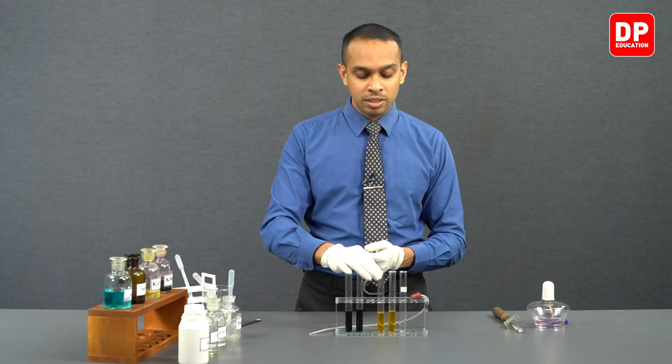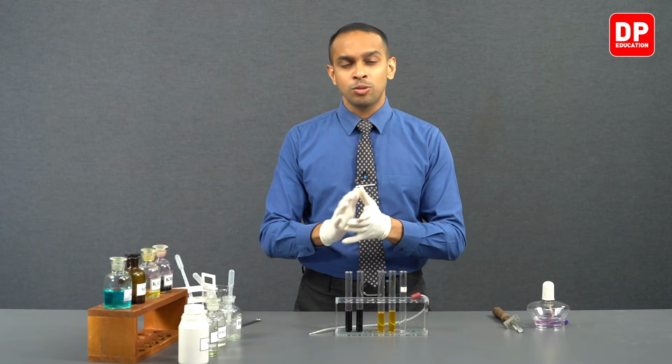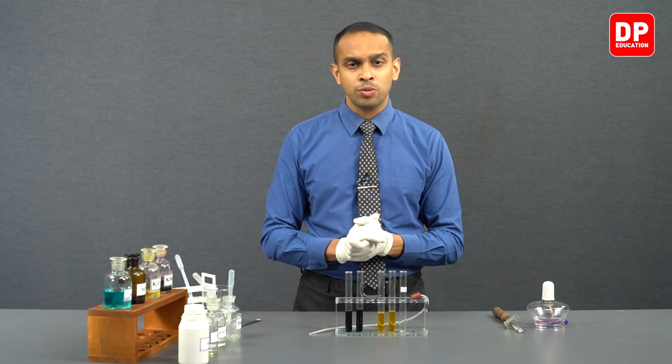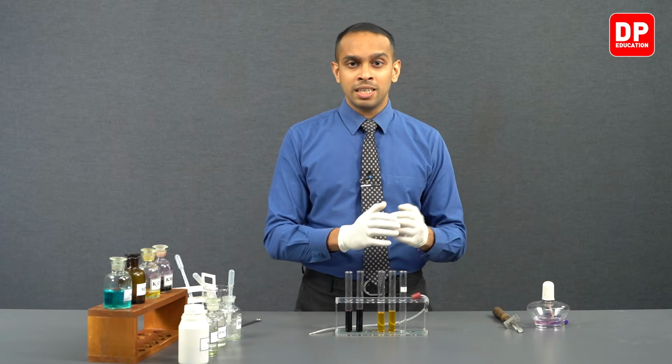So what happens in this reaction is dichromate ions will get reduced to chromium 3 plus ions, which will turn the solution to a green color, and hydrogen sulfide or the sulfide ions get oxidized to form sulfur.